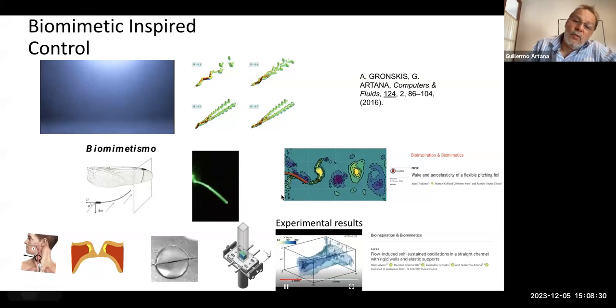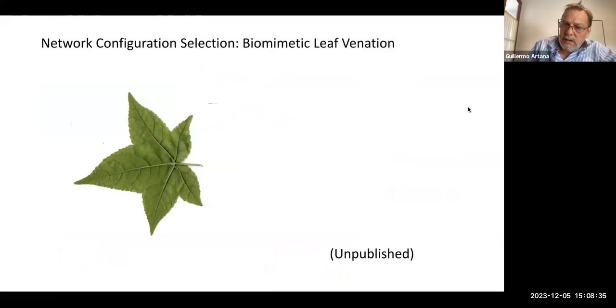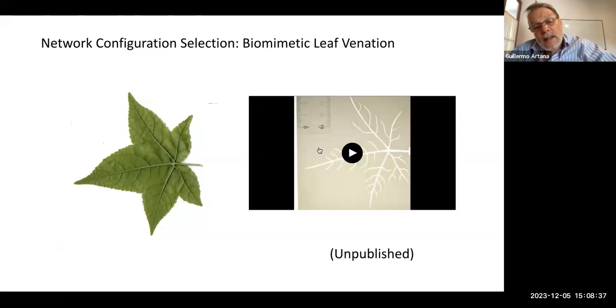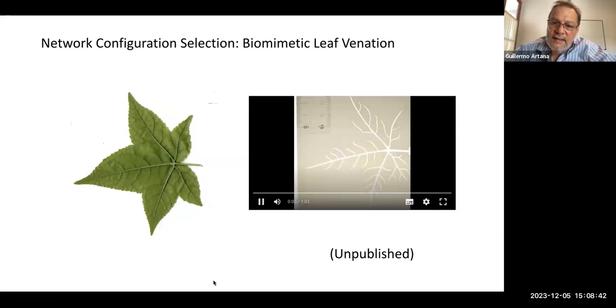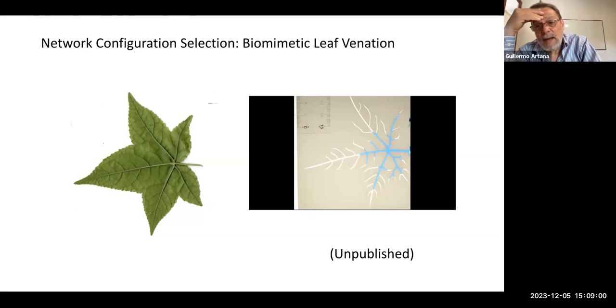We are now interested in the design of a configuration of channels related to leaf venation, in which we are trying to obtain some information or some criteria to develop configurations of channels inspired by leaf venation. This is unpublished, and this is ongoing work.